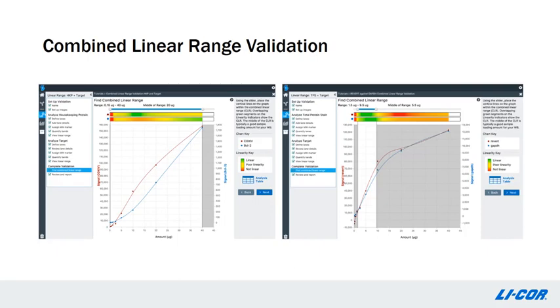For example, on the left, we see an example where the loading control and the target do not have a combined linear range, as seen that there's no combined area where green reflects that linearity. On the right, on the other hand, we do find a combined linear range for both your target and loading control, and it tells us that we should load 5.5 micrograms. Now, this is going to be very useful supplementary data for publishers as well as reviewers because it'll tell them that you did all the calculations and they can trust the calculations of fold change and quantification differences.